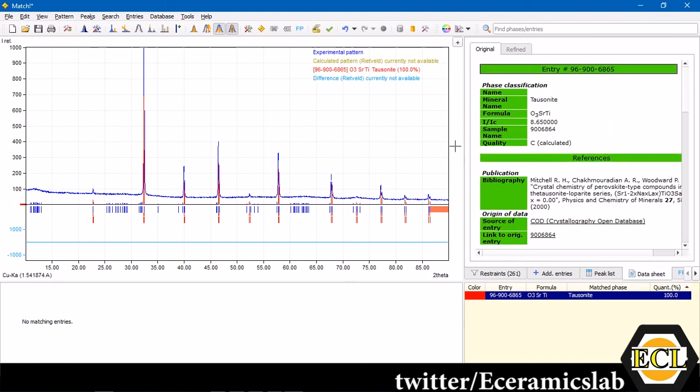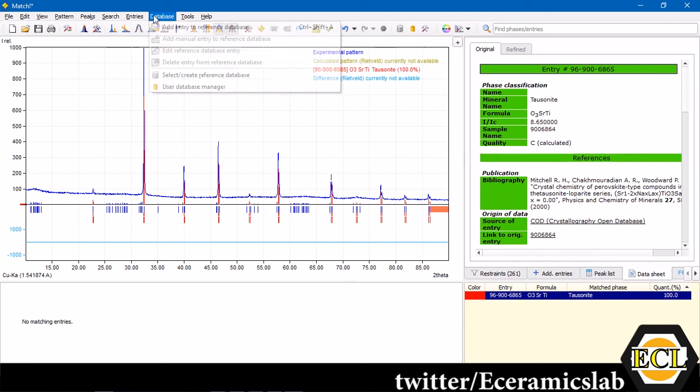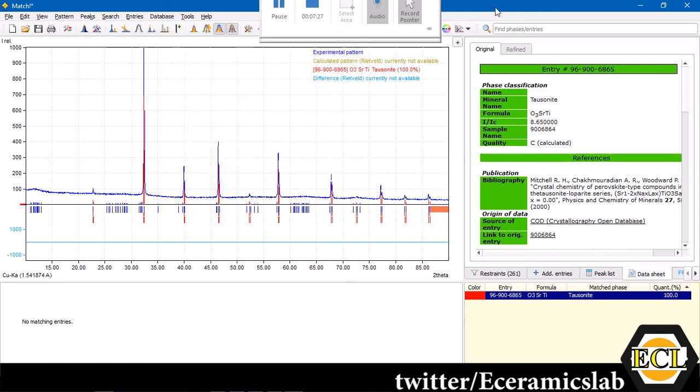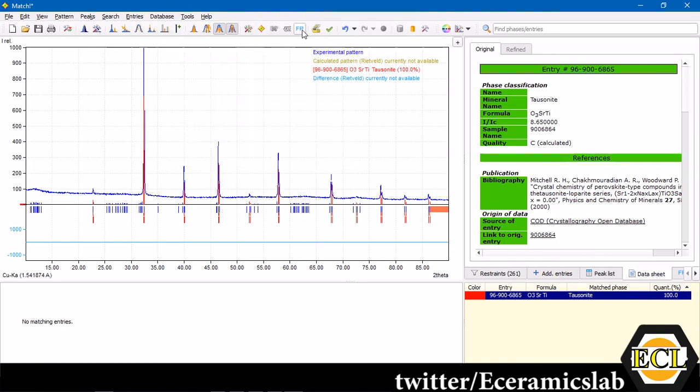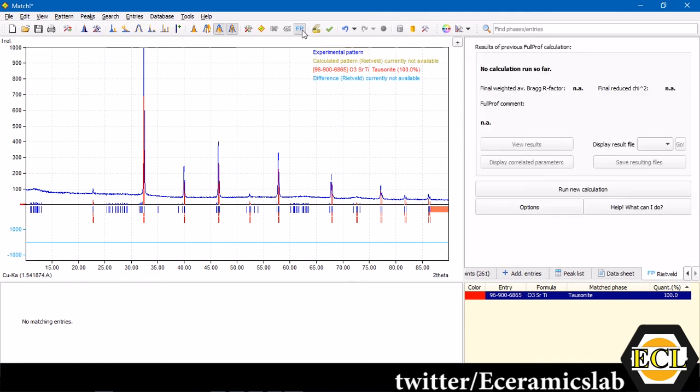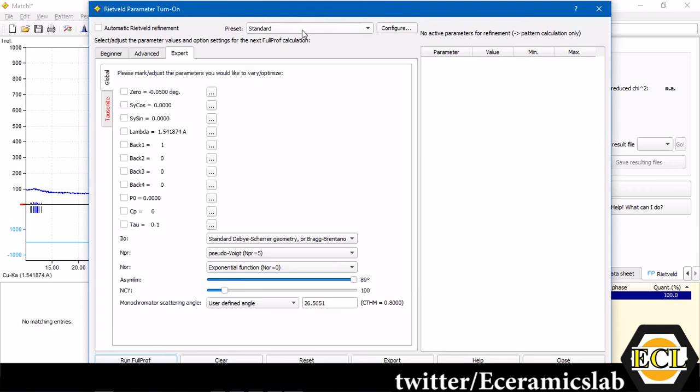Here we have selected the reference file. To do the Rietveld refinement, we'll just go over to Fp. Here you can see, set up and run Rietveld refinement calculation using FullProf. Again, you have to have installed, pre-installed FullProf software. Now you click it, FullProf. And a window will appear.